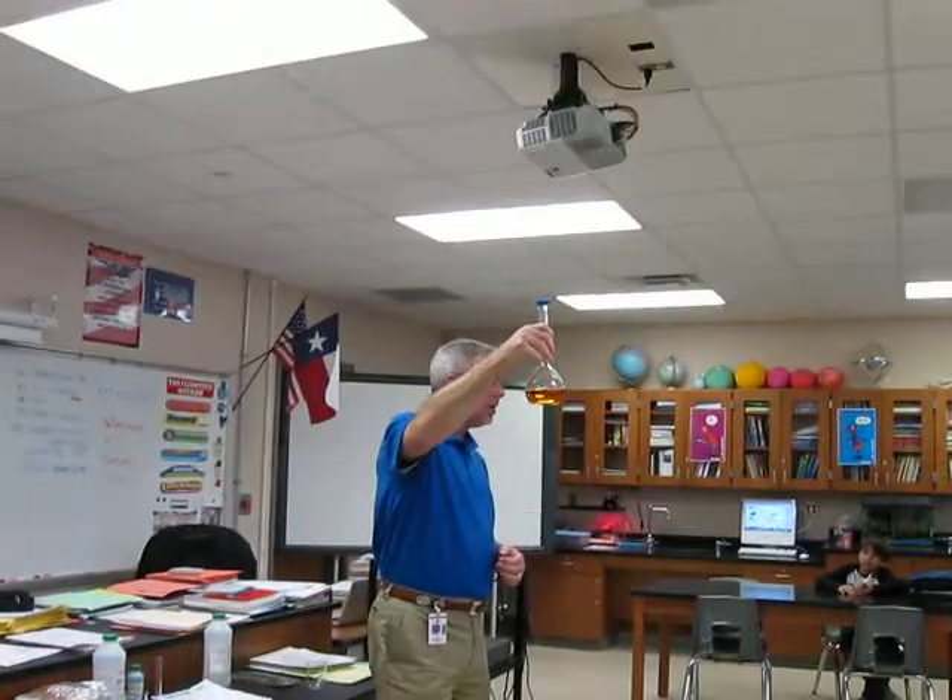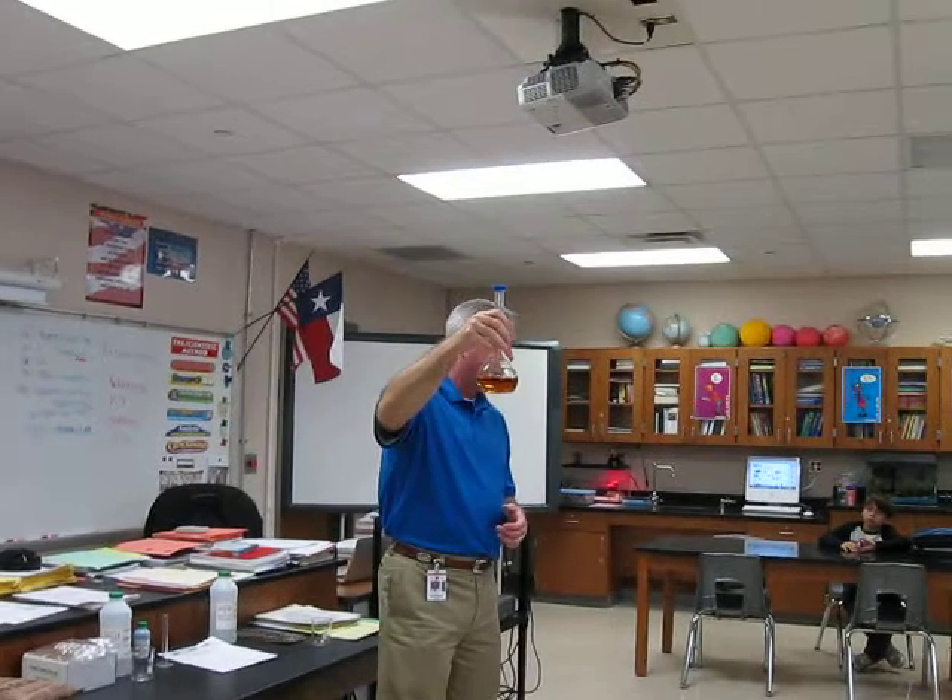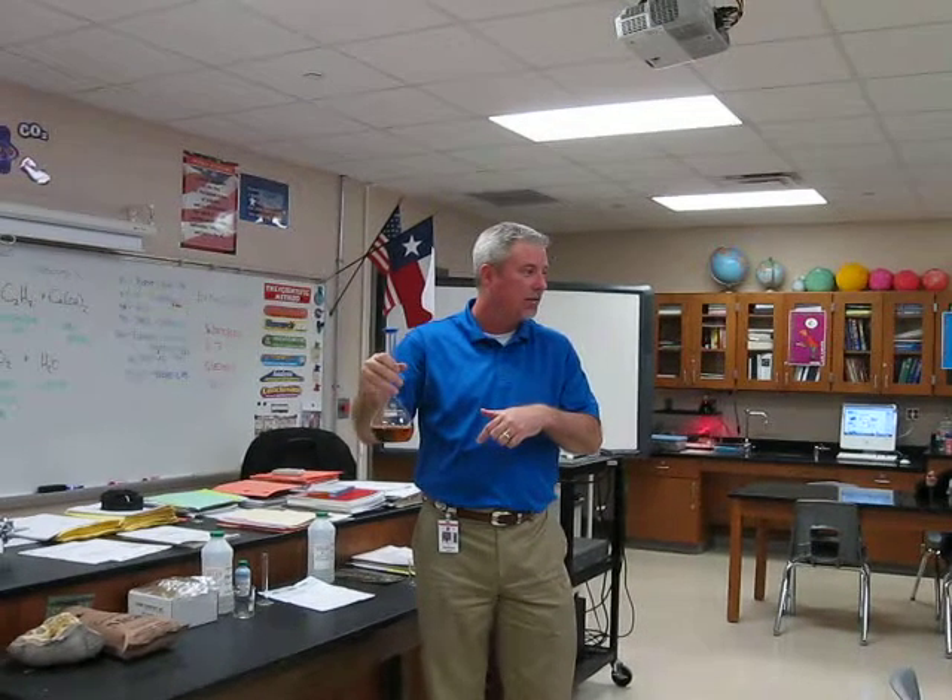Guys, this is what they call a stop and go reaction, and I want you to check and see what was the sign that a reaction took place inside of this particular beaker, or this flask. Come on in and zoom in.